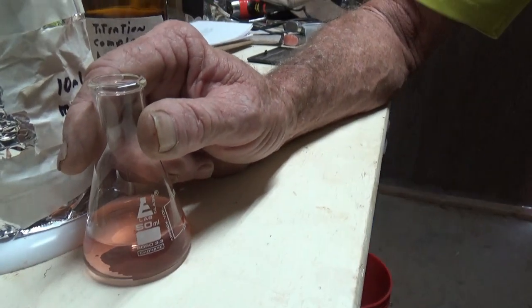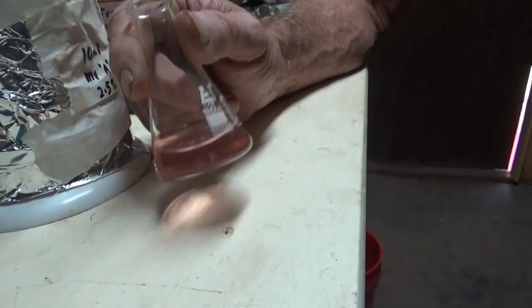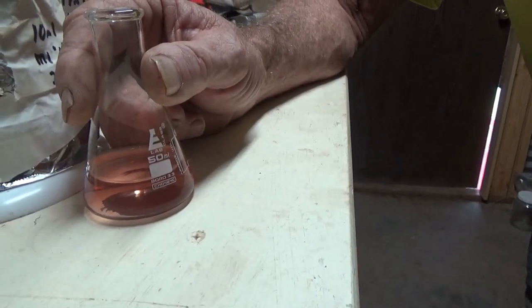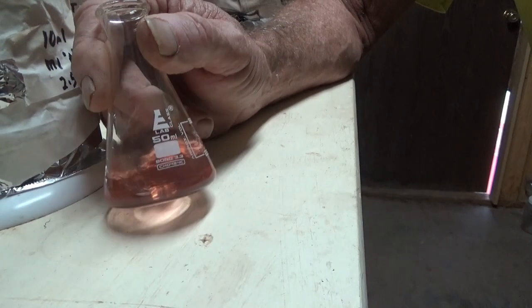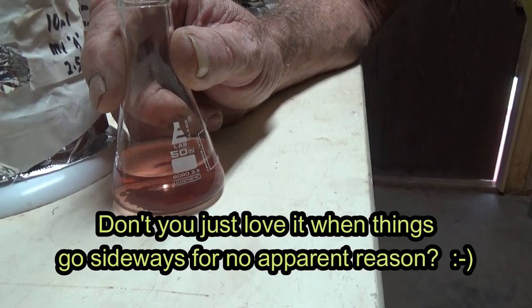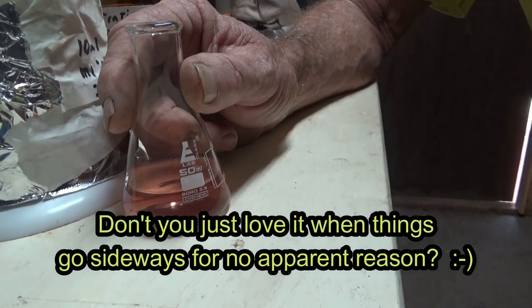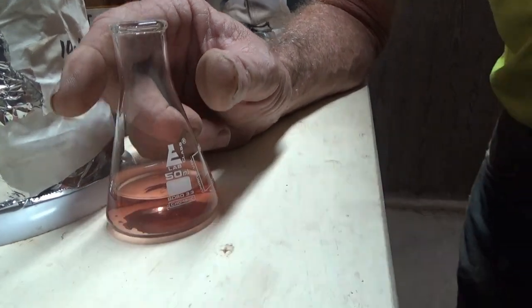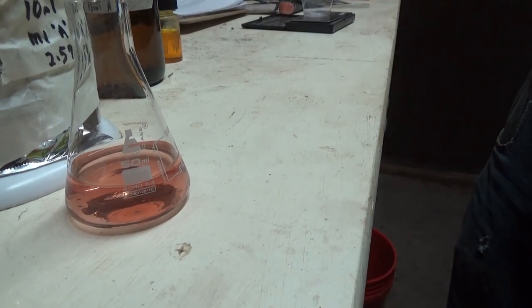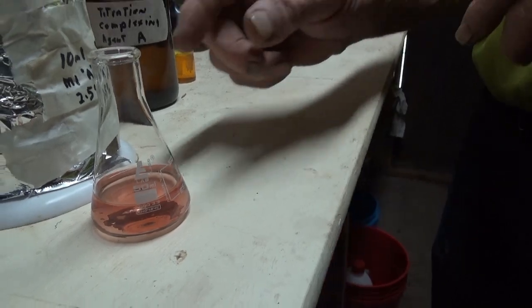It's about 1%. So for whatever reason, this stuff takes 10 times as much reactant to neutralize as the instructions say. Now, I don't know if that's faulty titrant. My guess is it's the Super Goldex here, and so it has more of something in it by a factor of 10. And that's what we're getting. So anyhow, there's that.